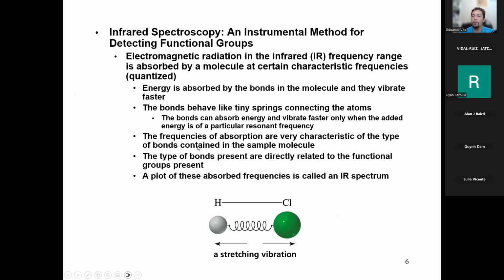So in IR, we use what's called the spring model, right? I have a spiral notebook with me right here. You can see this is kind of like a spring, sort of. The spring is very flexible, so I can bend it and wag it. And of course, if the paper wasn't on here, I could just stretch it out and distort it. So you could think of the bond between two atoms as a spring, and it can wiggle and vibrate and compress and stretch.